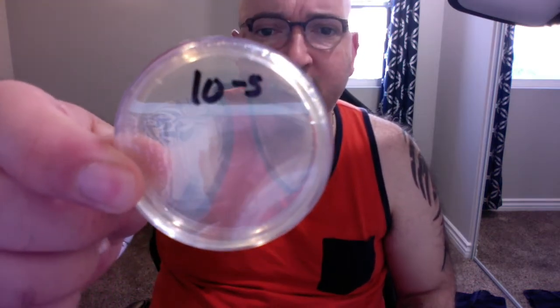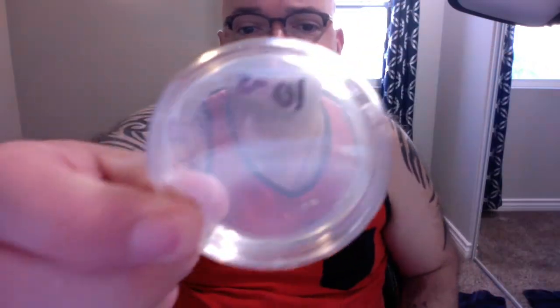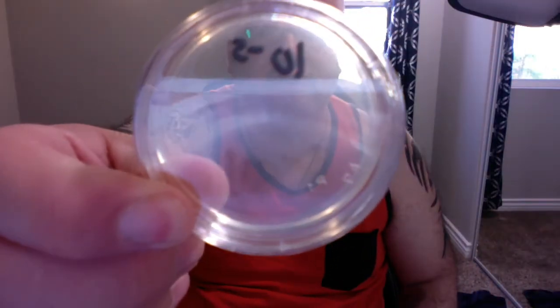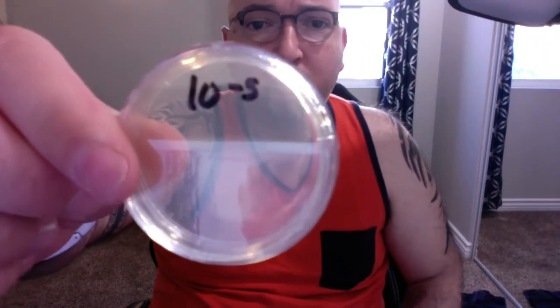And then this is my dish 5. Dish 5 and dish 6, I'm going to show you, are getting very dilute, where there might be pretty much more water than anything. As you can see, there's really no growth whatsoever in here.